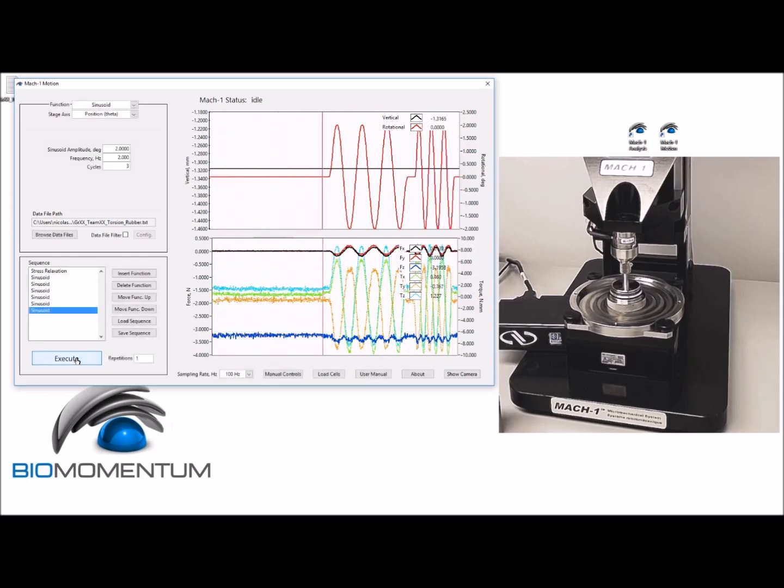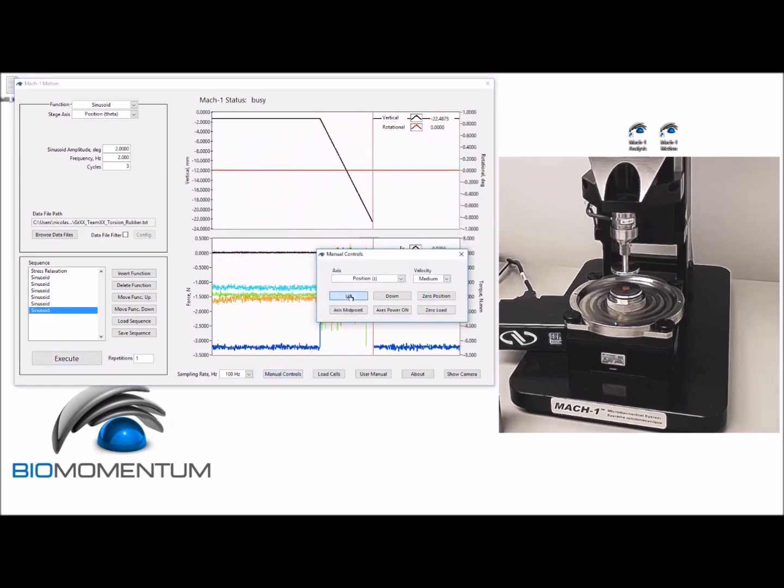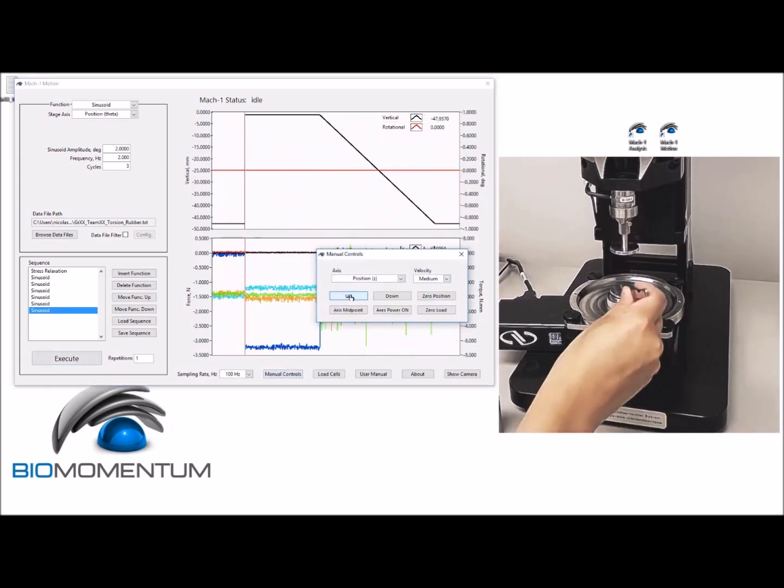Now that the torsional shear test is done, using the manual controls, raise the stage above the sample holder and dispose of the rubber sample.